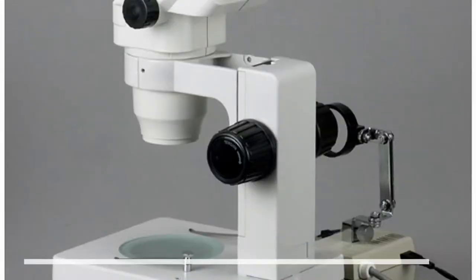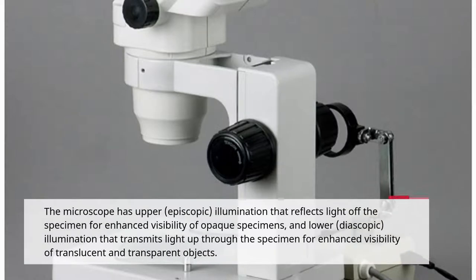The microscope has upper, episcopic illumination that reflects light off the specimen for enhanced visibility of opaque specimens, and lower, diascopic illumination that transmits light up through the specimen for enhanced visibility of translucent and transparent objects.